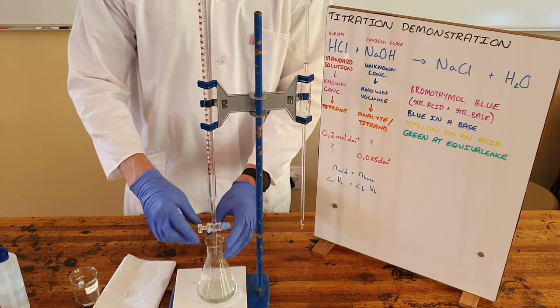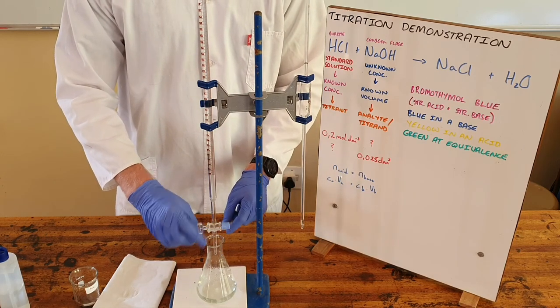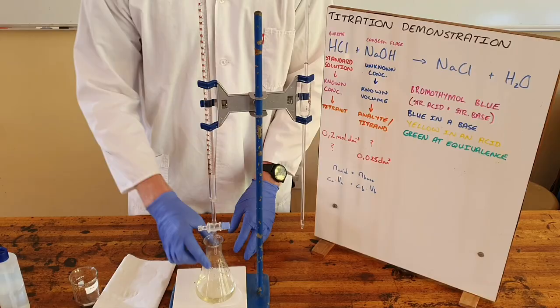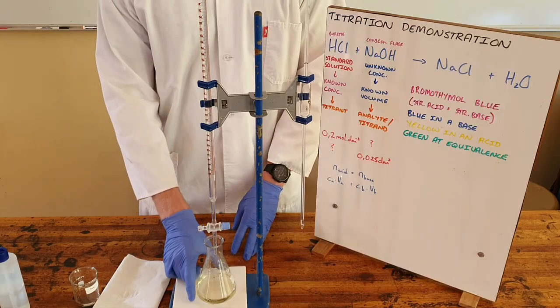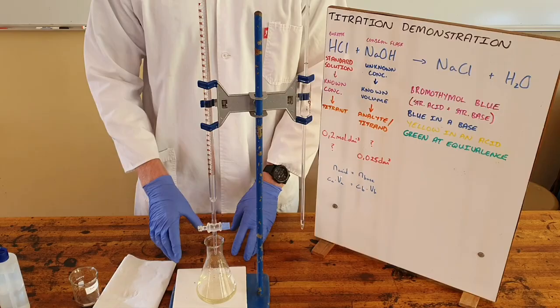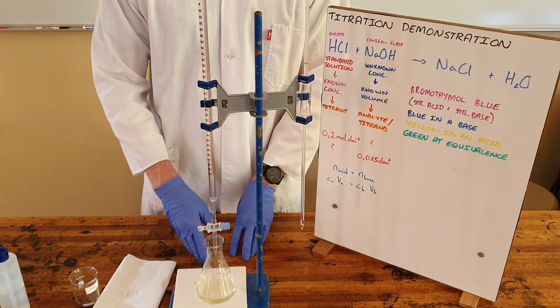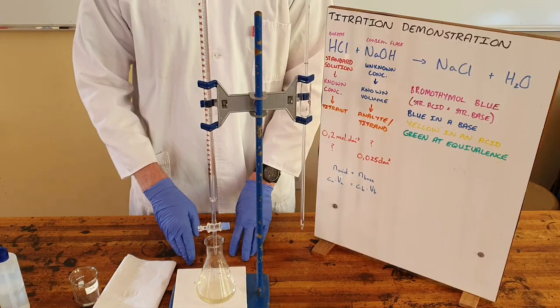What I'm now going to do is I'm going to add a bit more acid to allow this to proceed to what we call the end point where you can see we reach an end point where there is now more acid present in the solution and this is now turned yellow so when doing a titration it's very important to do it slowly enough so that you reach equivalence point and you can stop it there and take your measure.